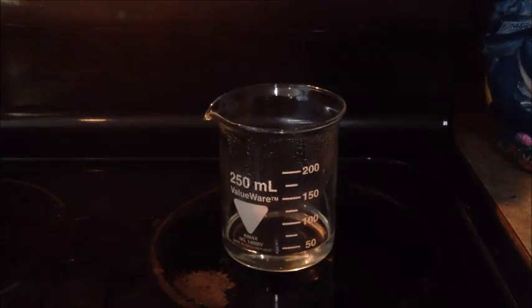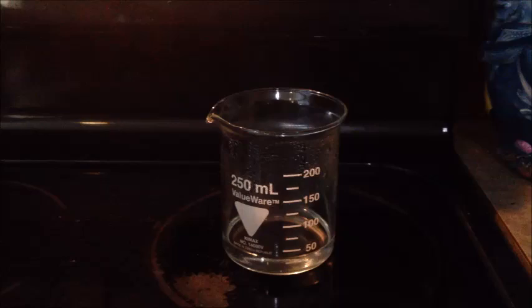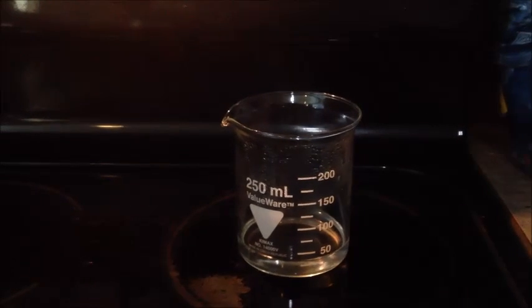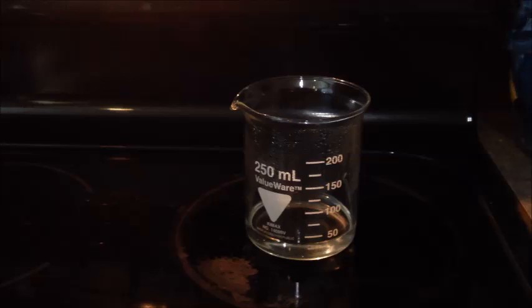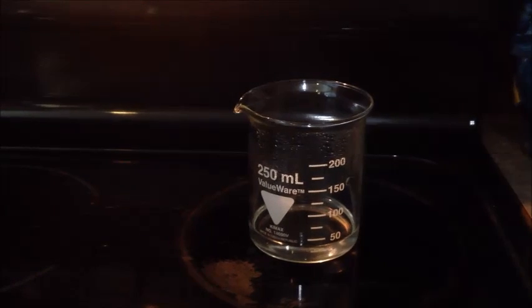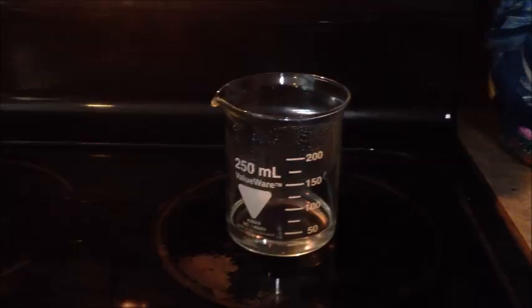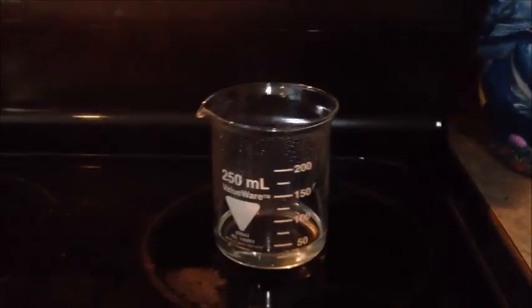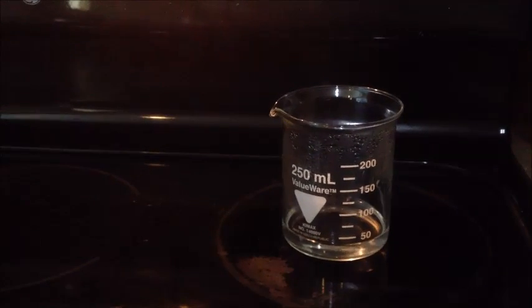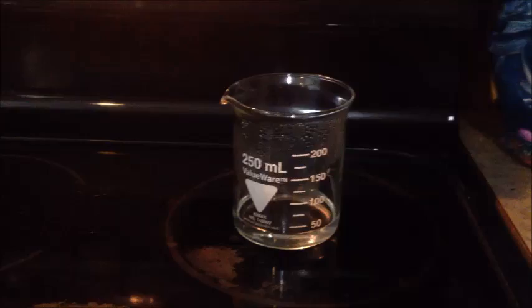Alright, so we're back after about 4 hours and it's finally got down to right on the 25 milliliter mark. So it's not exactly 30% but for what I'm using it for, all I need it to be is like over 20%. I'm going to turn the burner off. You've got to be really careful handling this stuff — not only is it hot right now, but it'll corrode your skin, so keep it off your skin.